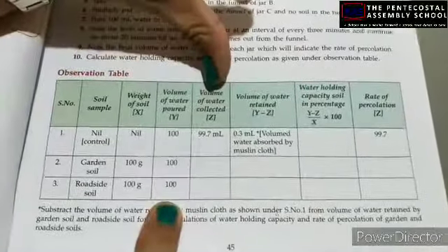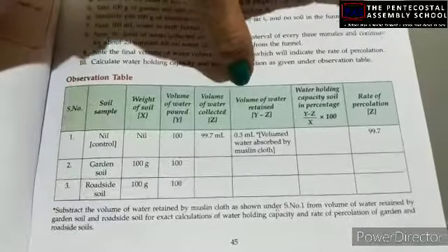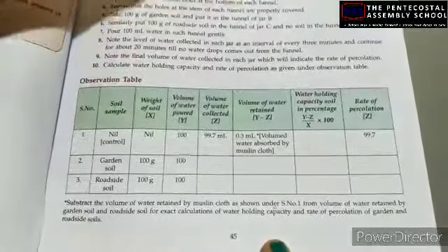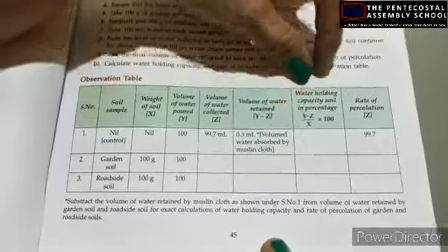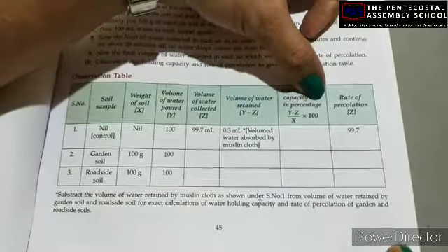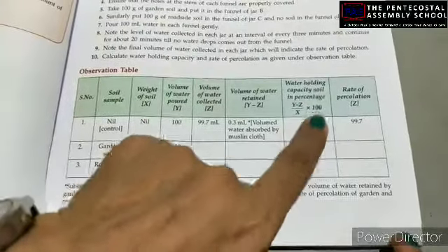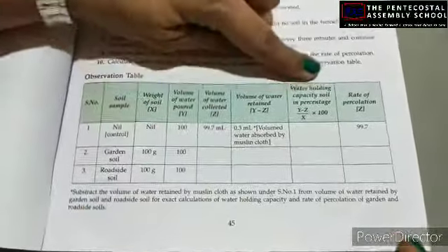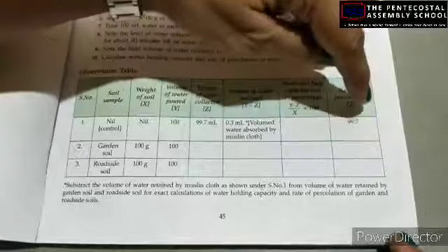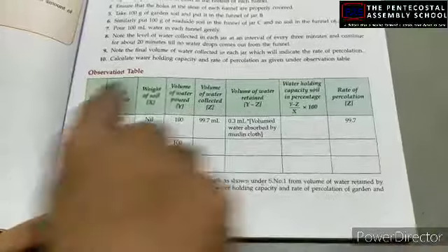Okay, then after some time we have to check the volume of water collected in the measuring cylinder, and with this measurement we can determine the volume of water retained by the soil. With this formula we can determine the water holding capacity of the soil in percentage: water retained in the soil divided by the weight of the soil, into 100. This will give the water holding capacity of the soil in percentage, and the volume of water collected will be the rate of percolation. So in this way we have to fill this table.